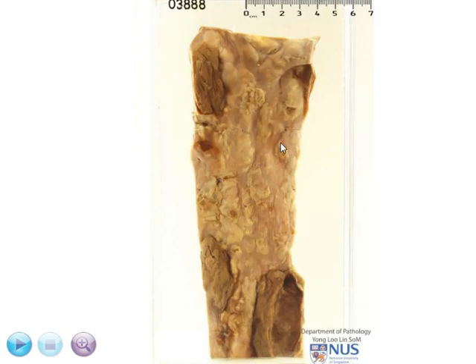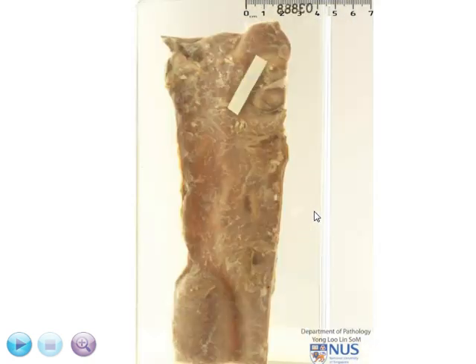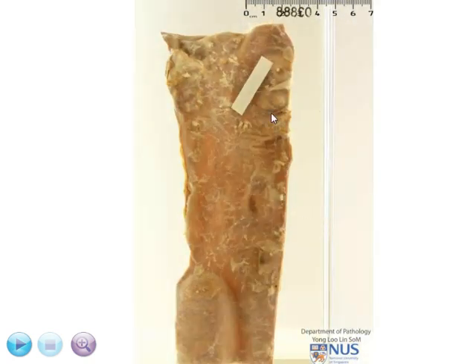This is a specimen of the abdominal aorta, and we're looking at the inner or the luminal surface here. When I turn it around, this would be the adventitial surface.